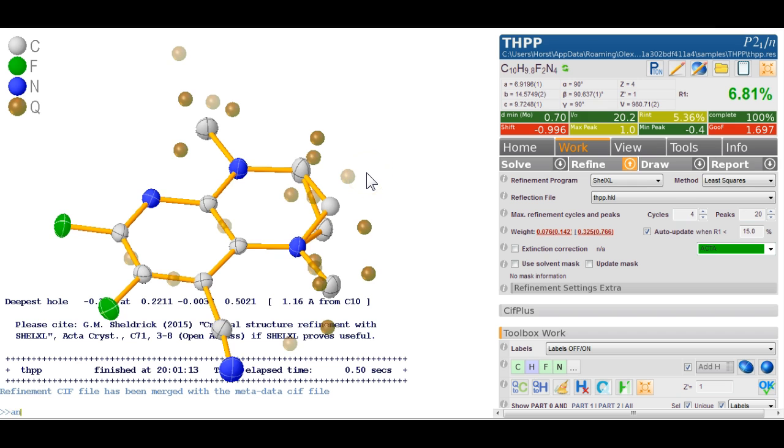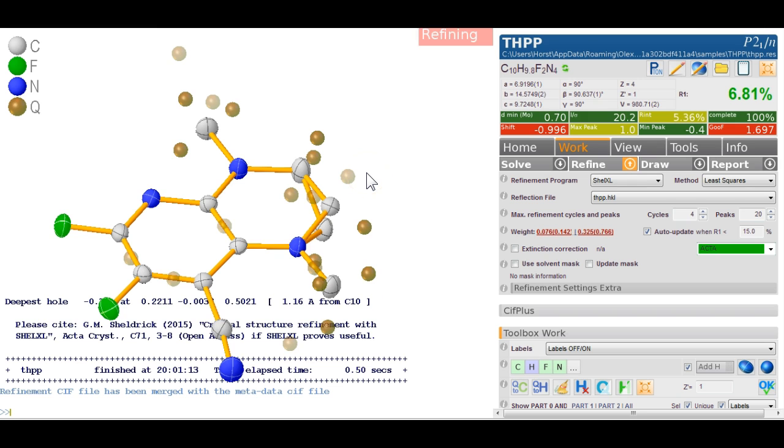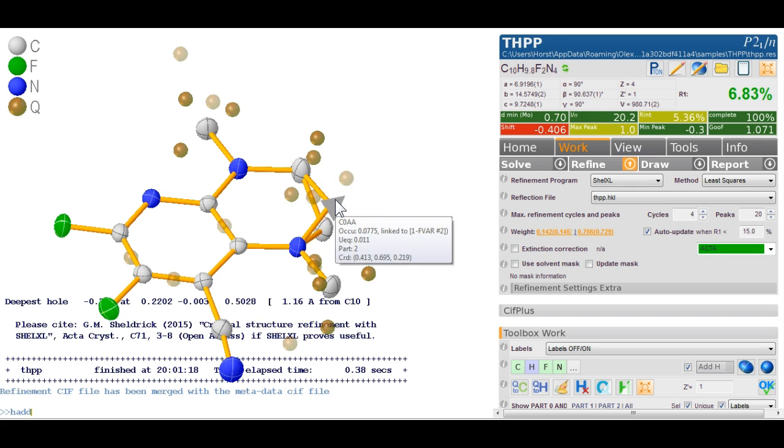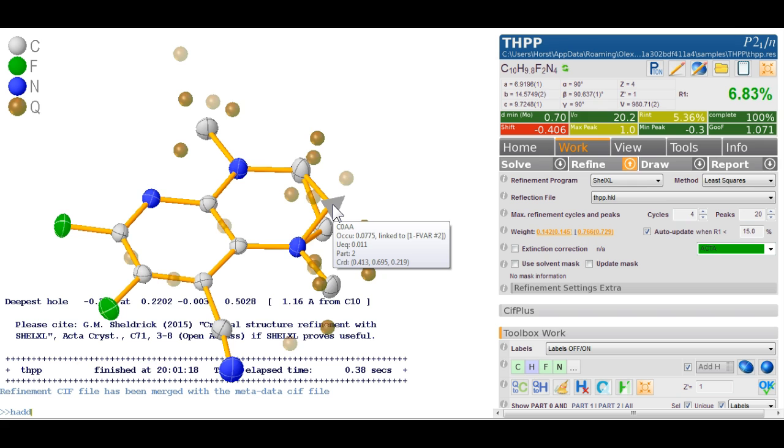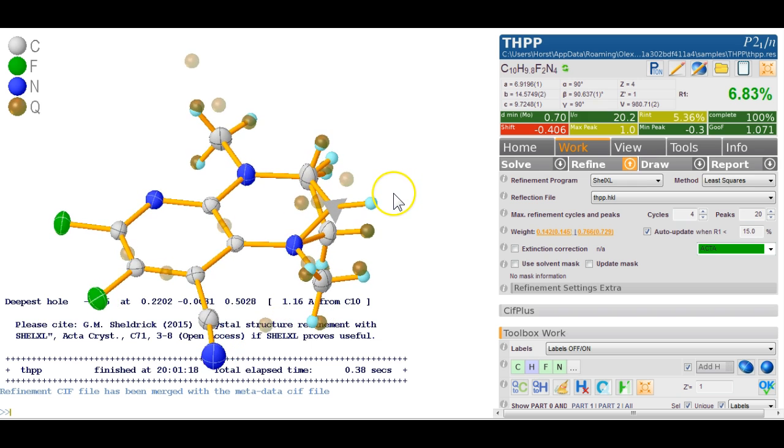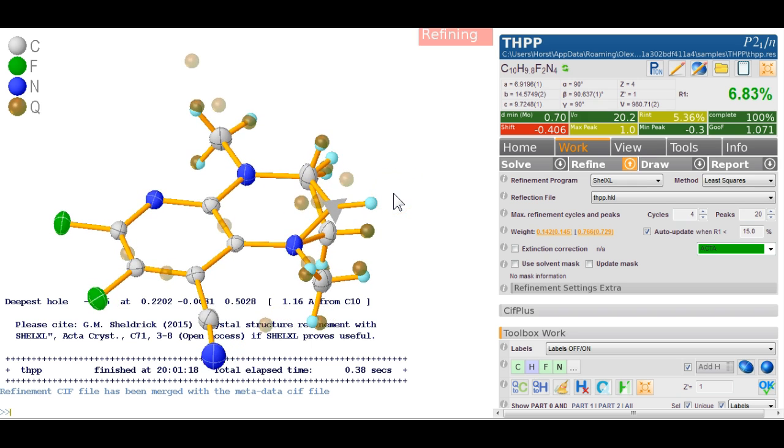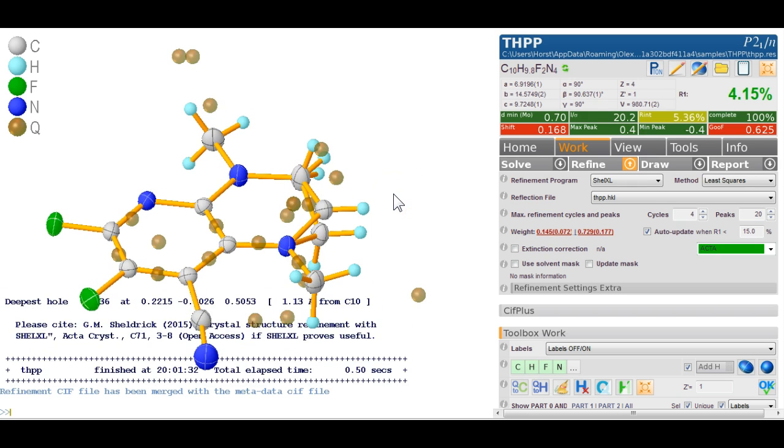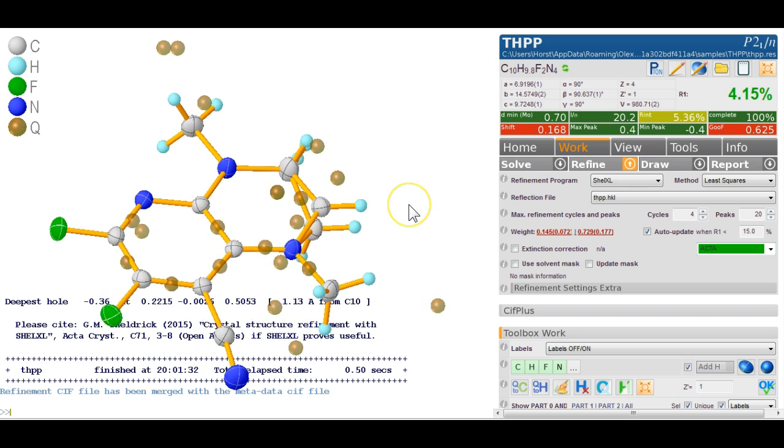Make it anisotropic and add the hydrogens to it and this has become non-positive definite but at the moment this is only showing at seven percent of a carbon so it's really a very very small amount. Adding hydrogens to this typically fixes this so we go back up and this looks wonderful now.